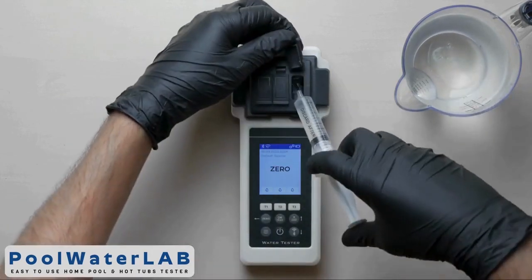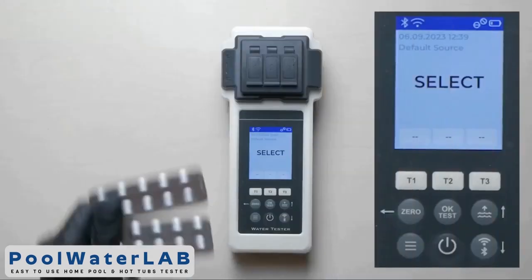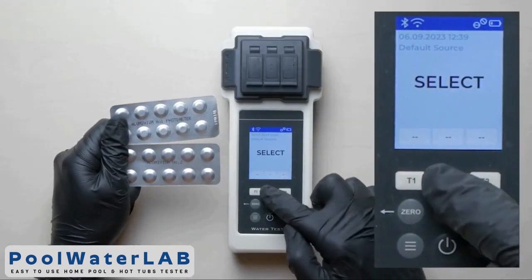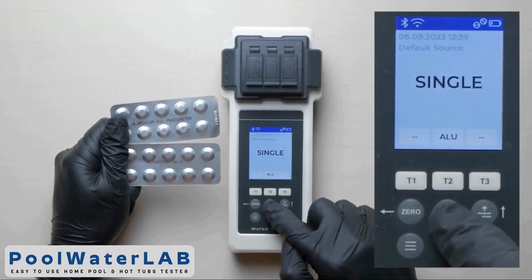Cover the camera with the light protection cap and press the zero button. Wait until the countdown ends. Press the T2 button to go to the menu. Use the up and down buttons to select the desired parameter.